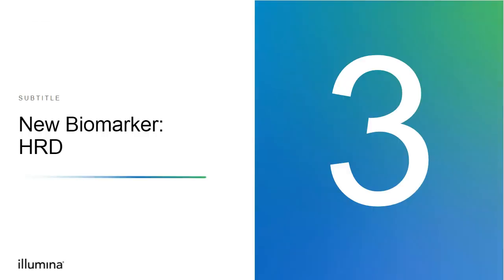Okay. The new biomarker that we're introducing in this release is HRD. So let me just quickly give a background on HRD if you're not familiar. We are aware that DNA is constantly being damaged and it repairs itself within our bodies. That process is what we refer to as homologous recombination. However, when the body is unable to repair the double strand breaks in the DNA, that is what we refer to as homologous recombination deficiency.